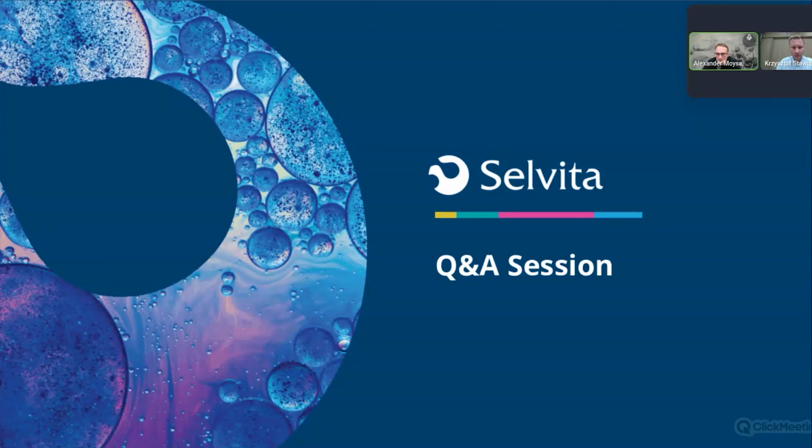Thank you. There is one more question coming from Tomasz about internal standards. Are you using internal standards for label-free measurements? Yes, we use internal standards for label-free measurements.